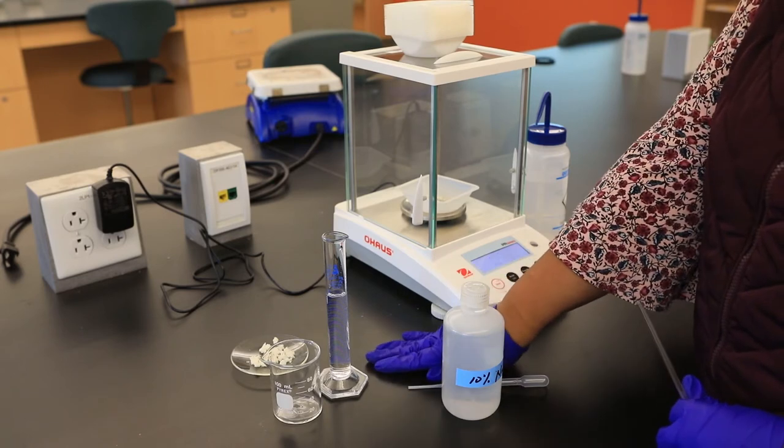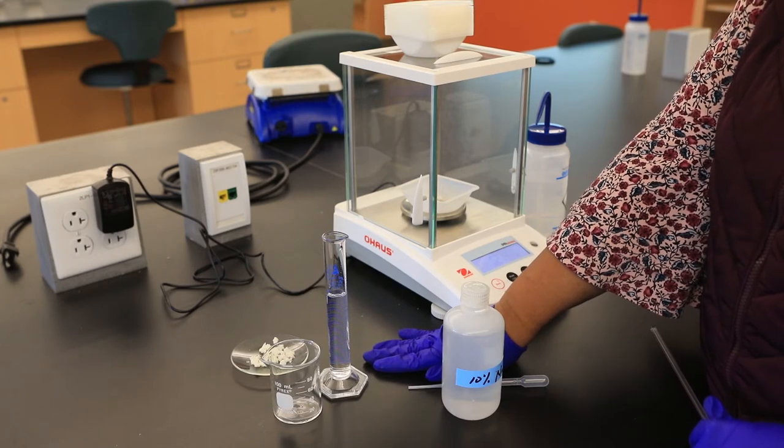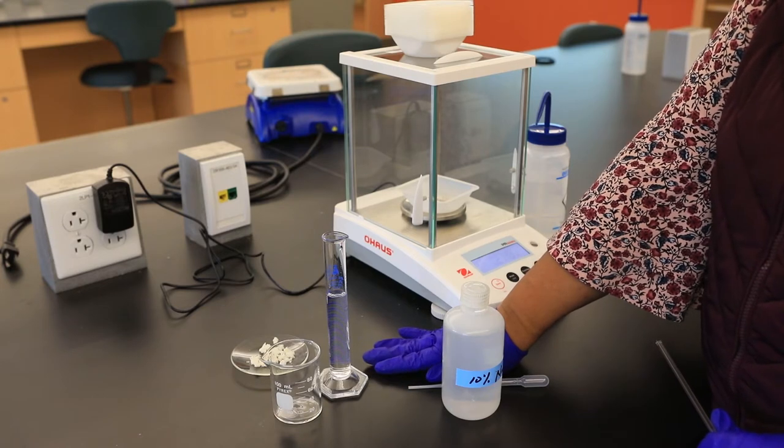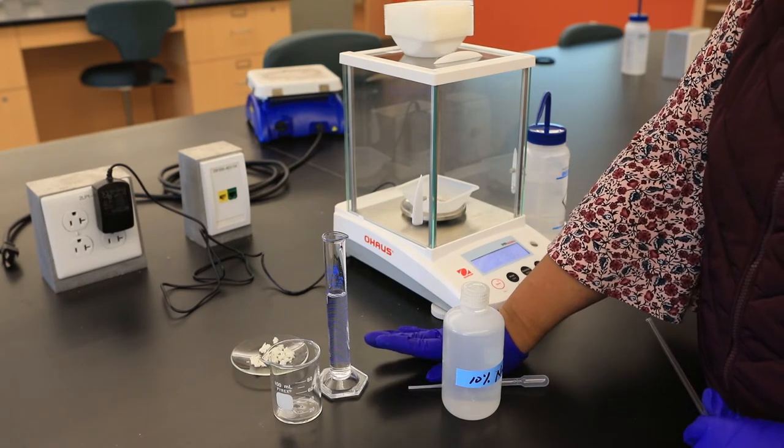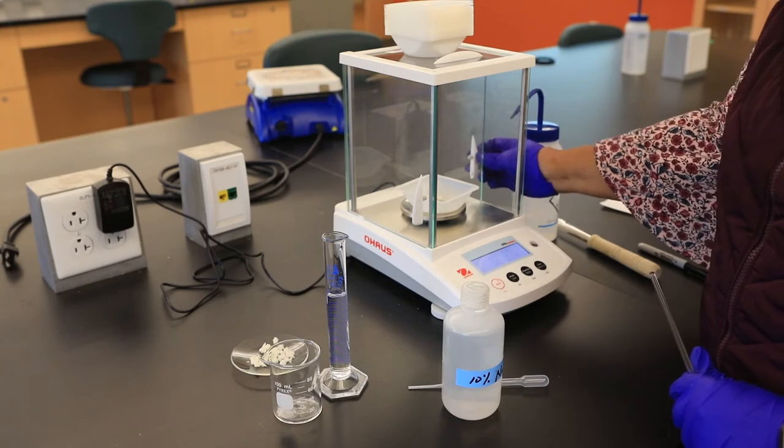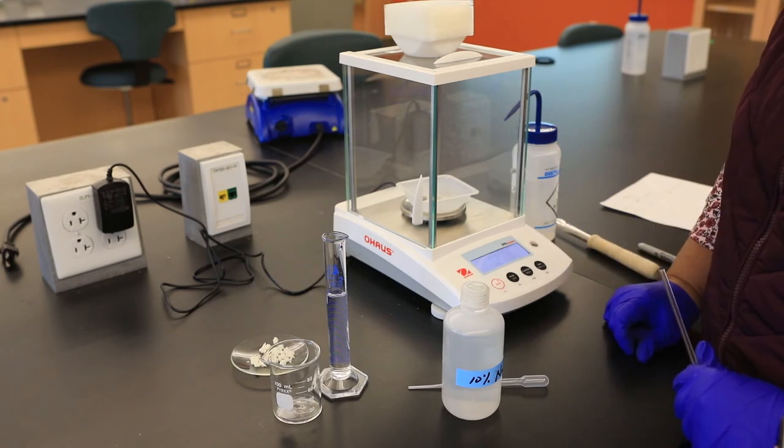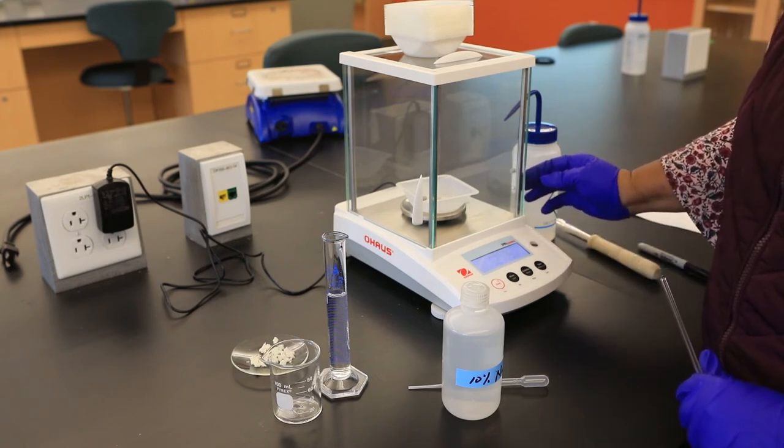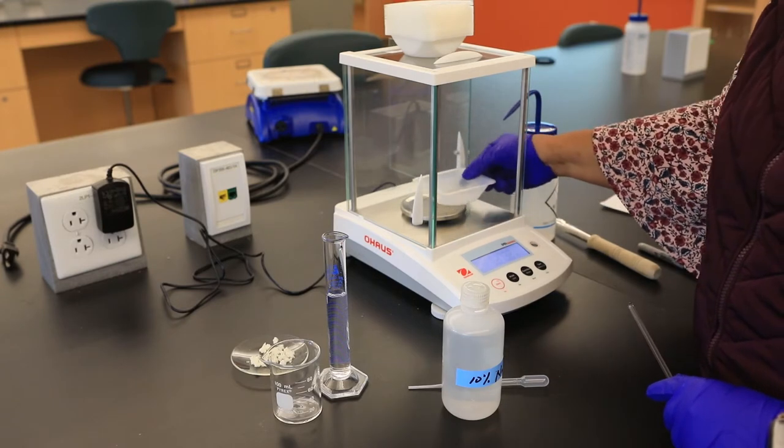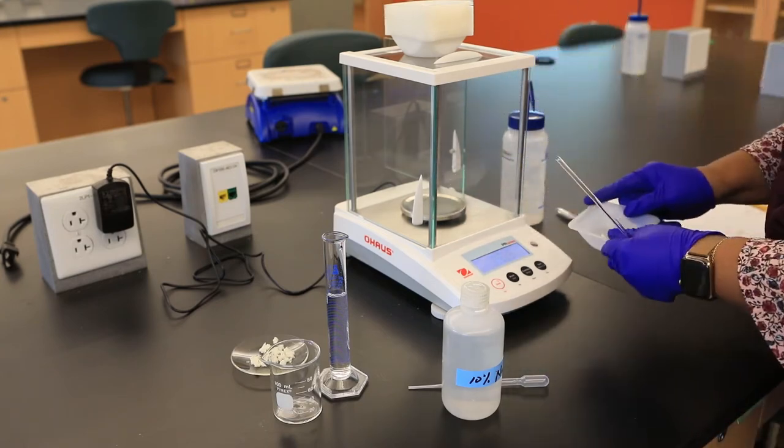In this part of the experiment, we're going to prepare a solution of casein for our tests. We'll be completing three tests: the biuret test, the coagulation test, and the test for heavy metals. Before we can do those tests, we need to prepare the casein solution. I've already pre-weighed exactly 0.273 grams of casein - the casein that was extracted earlier from our dry milk.